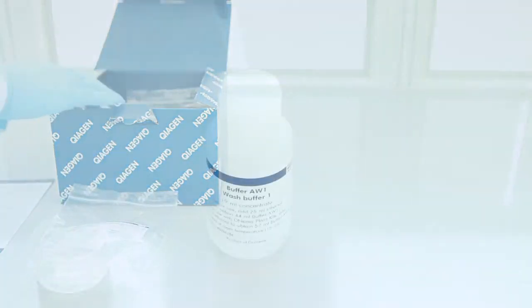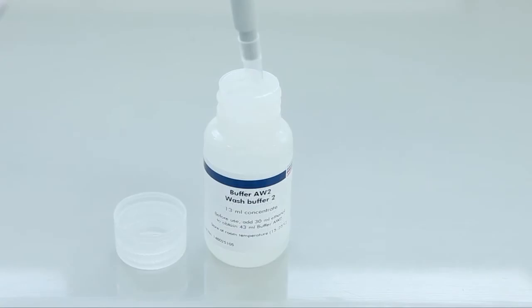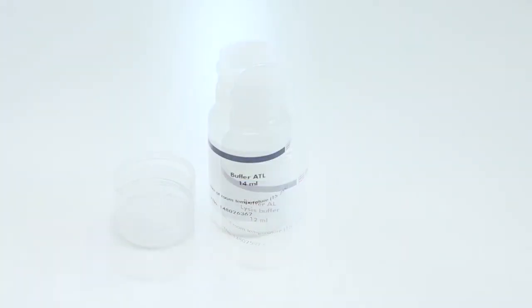Inside the box, you'll find buffer AW1 and AW2, which are supplied as concentrates. Before using these for the first time, add the recommended amount of ethanol into the bottles. Next, check the buffer AL and ATL bottles for precipitates. If present, re-dissolve these.